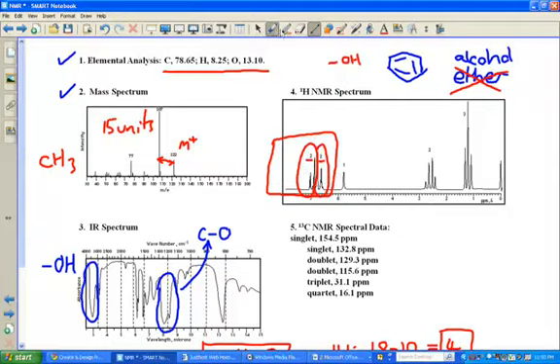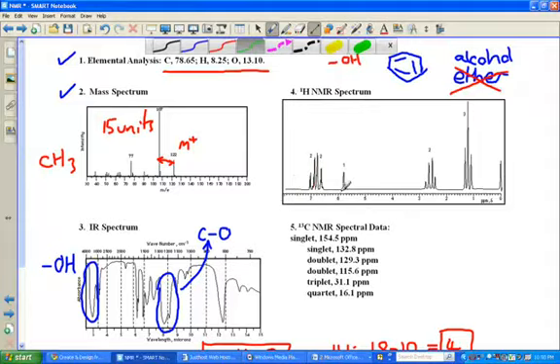Alright, if I just delete all that, it's extremely easy to get confused into thinking, well, actually, that's a quartet, isn't it? And actually, that would be fine if there was just one single number up above that peak. But there isn't one, there are 2. So therefore, we don't have just one set of hydrogens, we have 2. This goes back to what you saw in a previous video and what you may have seen in some of your questions before. That these are actually 2 doublets that are spaced very close together, looking suspiciously like a quartet. But those 2 doublets, now we know that that's what they are.